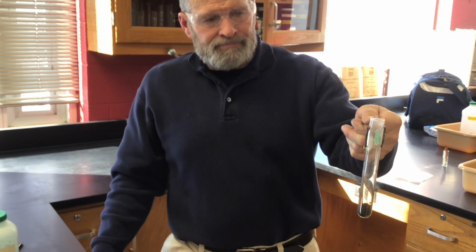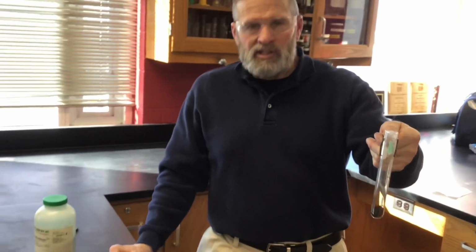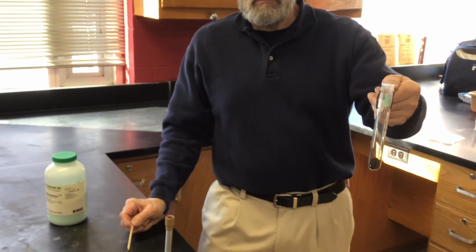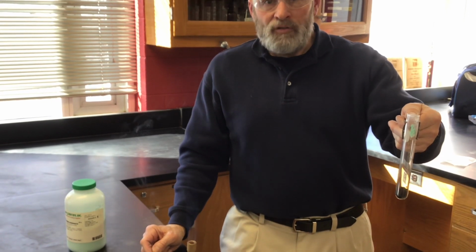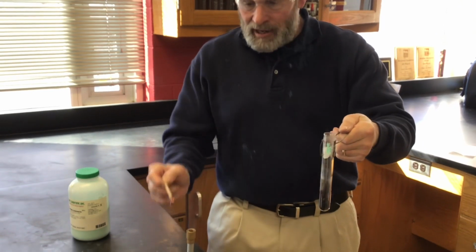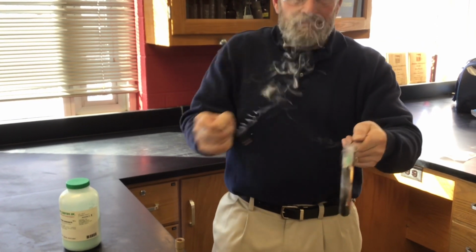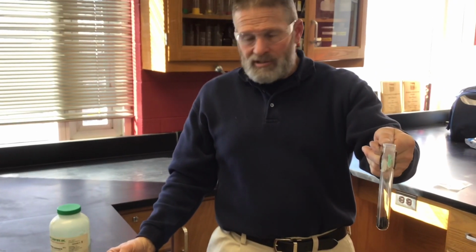I believe there are some fire extinguishers that operate on this principle. I think so. Yep. Prevents the flame from burning. Right. I mean, the best hint is if there's no oxygen, there's no flame. So one thing we know is there's not much oxygen down in the test tube. And whatever it is, I'll bet you it's still there. Right? Whatever it is staying in there because it extinguishes now just as well as it did a minute ago.